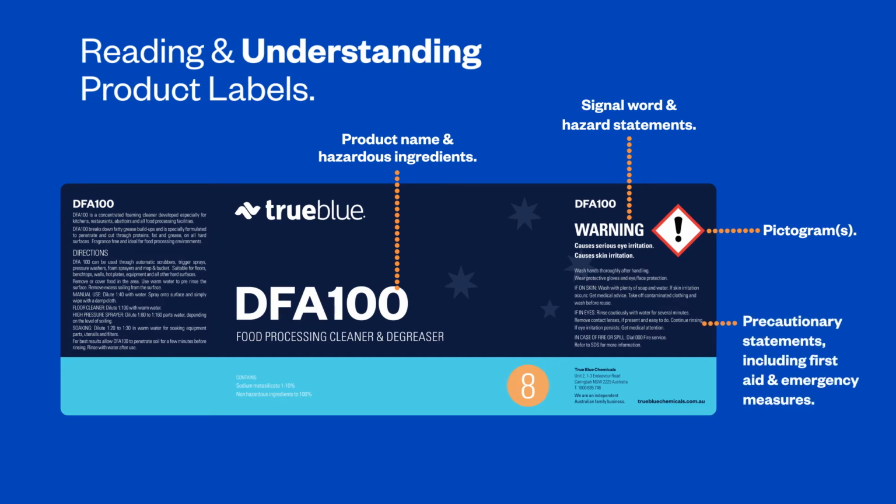Precautionary statements are a set of preventative and first aid instructions to minimise exposure and explain treatment methods for when accidental exposure occurs. Depending on how much space there is on the label, this list may not be comprehensive. You will find the full list of precautionary statements in Section 2 of the Safety Data Sheet. That is why it is very important to read the SDS before handling each chemical.